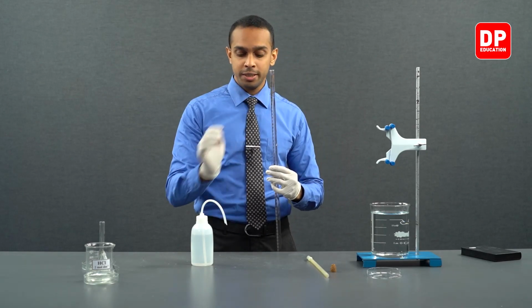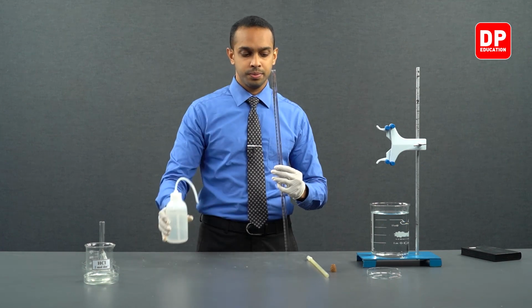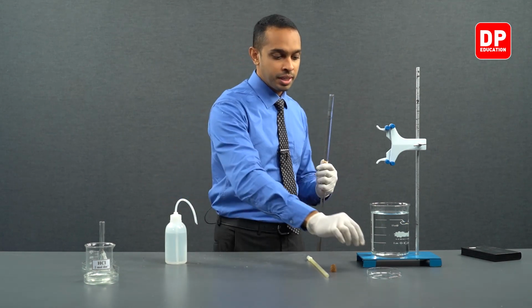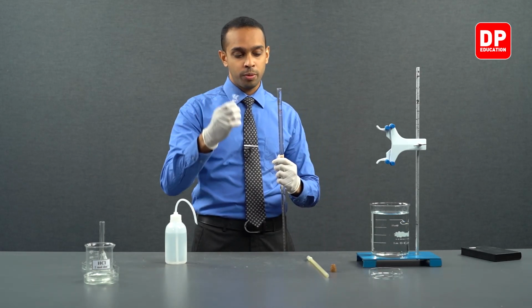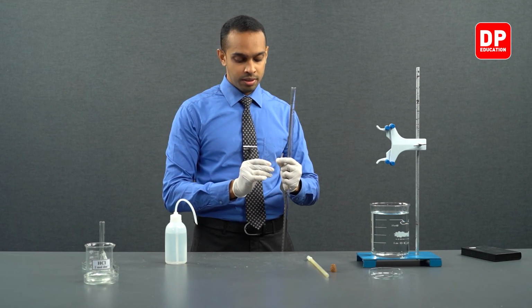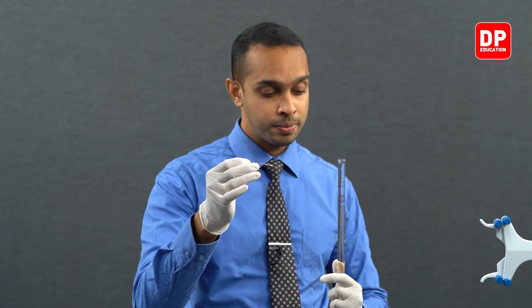Now, as you can see, we have added water all the way to the top. And now, we will be using this magnesium strip secured in a copper wire. We will be inserting this magnesium strip into this burette, and then we will be securing this copper wire and the magnesium strip with the help of our cork.